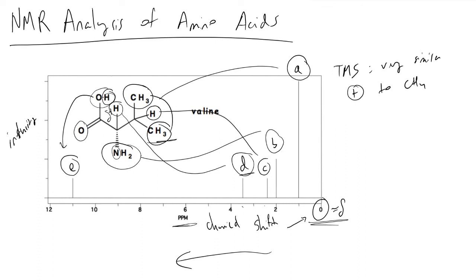This concludes a general introduction on how we can use NMR to analyze amino acids. If you look at the other amino acids, they will all have unique NMR spectra. If you have a photographic memory, or we can turn to computers, then if you know you only have one amino acid in your solution, or any, we can figure out which amino acids are present via this kind of analysis.